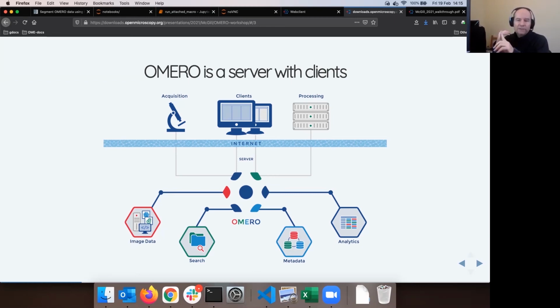Okay. It's also responsible for maintaining and monitoring the size of the storage disk of the Omero server, and again doing the appropriate things that a system administrator of a normal server would do, meaning raising a red flag in case the disk space is running thin, etc. It's also responsible for patching the server with security patches, as is normally done.